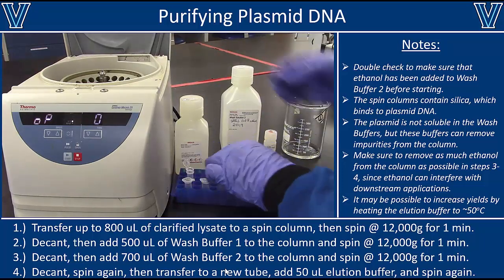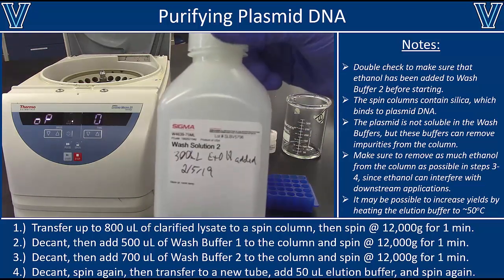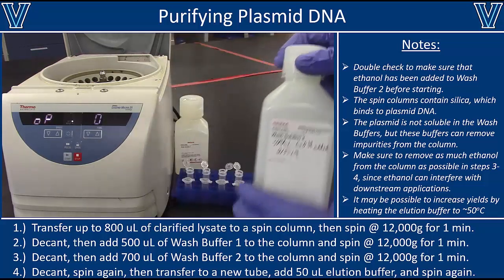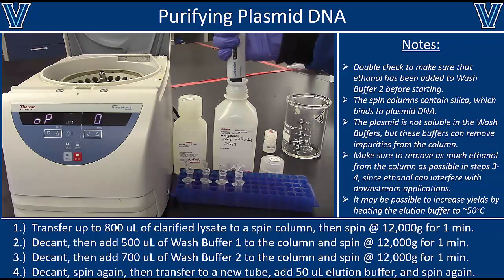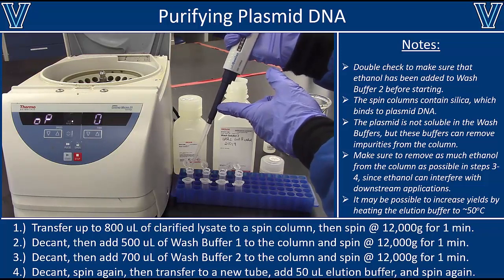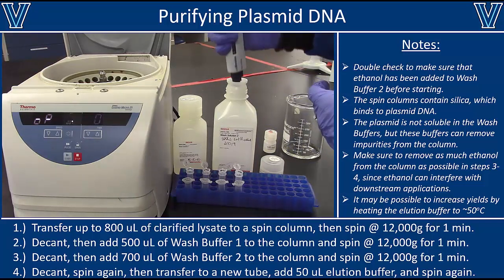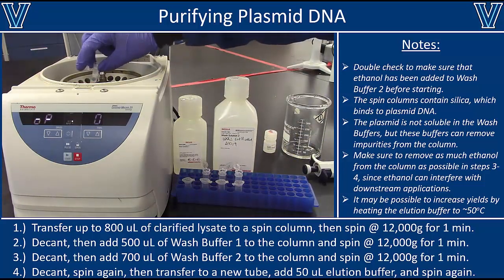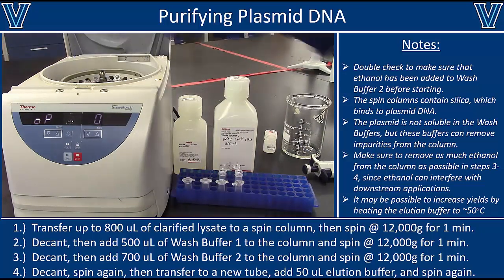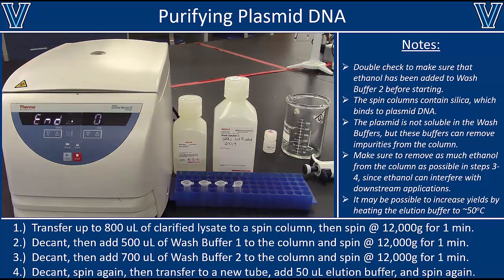So now we have partially purified DNA on the resin, but there are still some impurities left. Once again, I just want to remind you that wash solution 2 has to have ethanol added to it. It's always a good idea to waft a little bit to make sure you can smell the ethanol, or at the very least mark that the ethanol has been added on the bottle. What we're going to do here is add 700 microliters of wash solution 2 to each of these tubes. Once you've done that, you're going to spin the tubes again at 12,000 G for 1 minute. This should remove the last of the impurities from that silica resin, leaving purified plasmid DNA on the column.